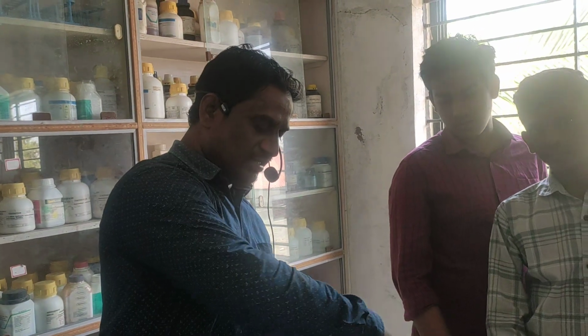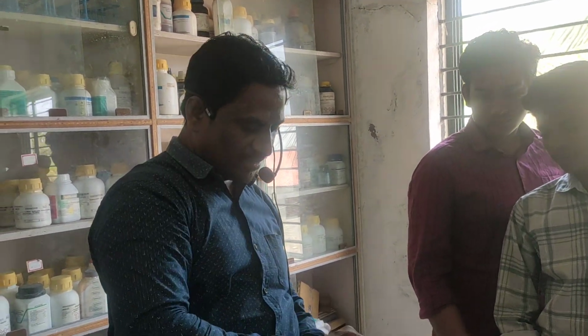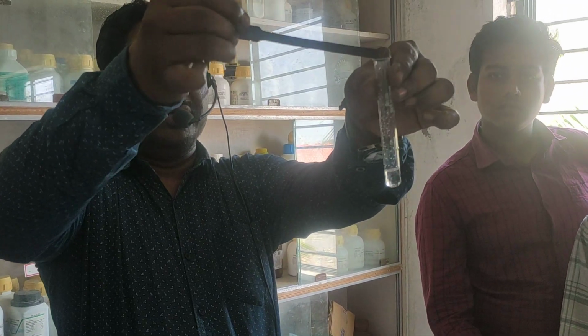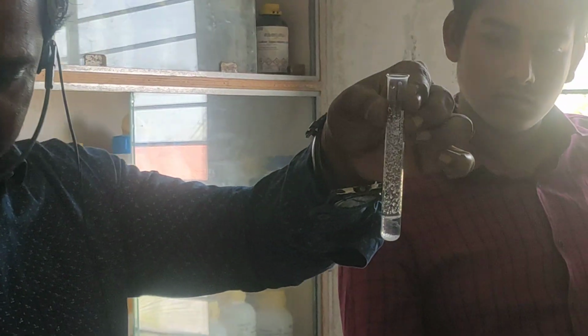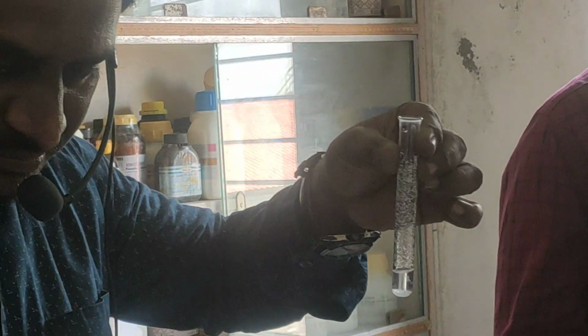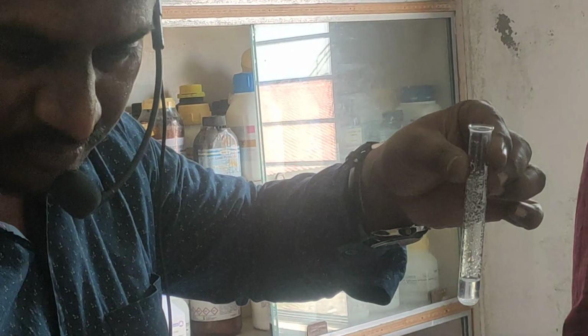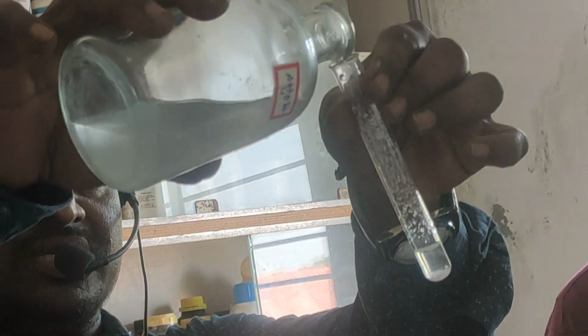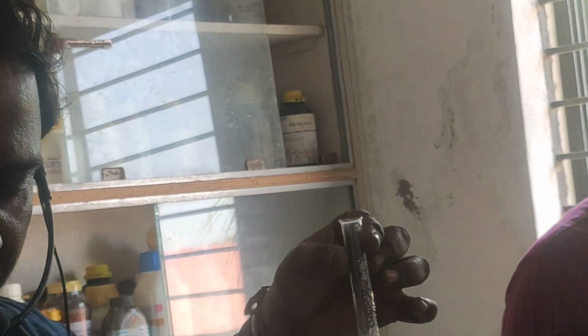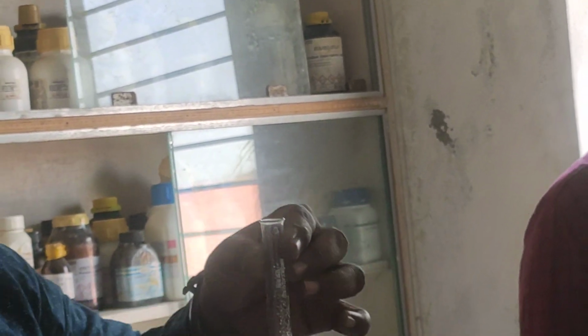For this original solution, I am adding ammonium chloride. Along with this ammonium chloride, I am also adding ammonium hydroxide, NH4OH. Along with NH4OH, what should we add? Ammonium carbonate I should add. Here it is, ammonium carbonate.